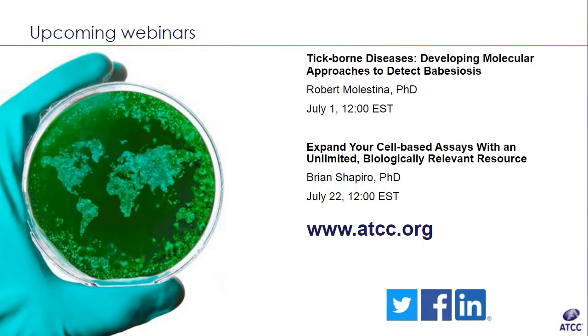All right, so let's go ahead and jump into our first question. So Kyle, how are the genomic standards extracted? So we try to use a commercially available kit where possible, but that doesn't always yield acceptable results for every organism, so we have to use classical methods for some cultures.